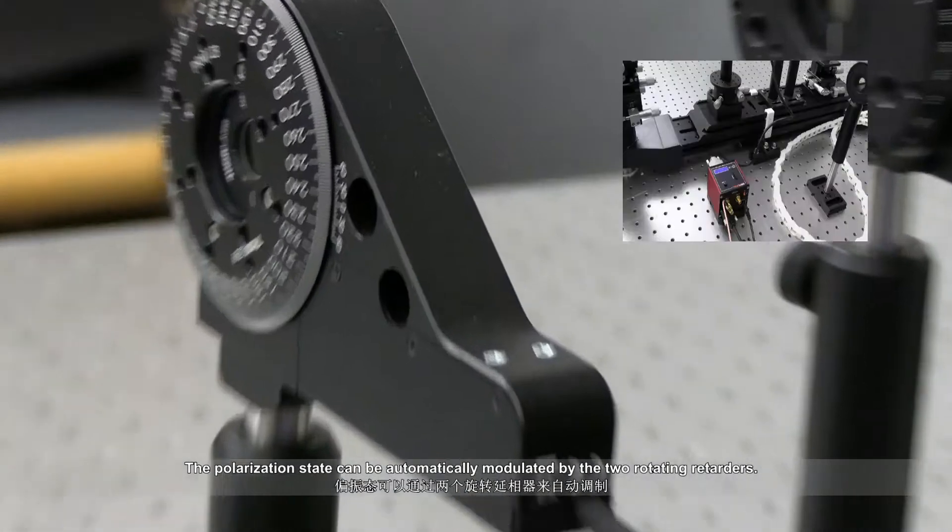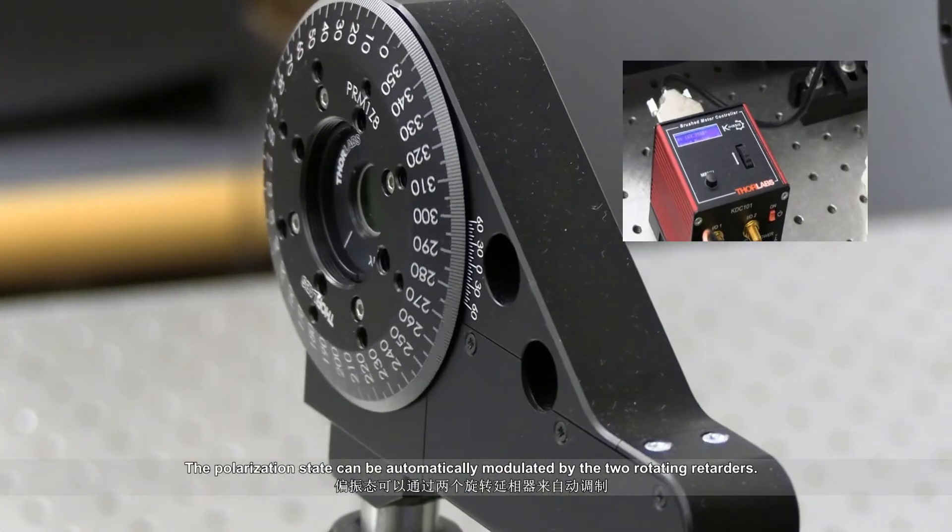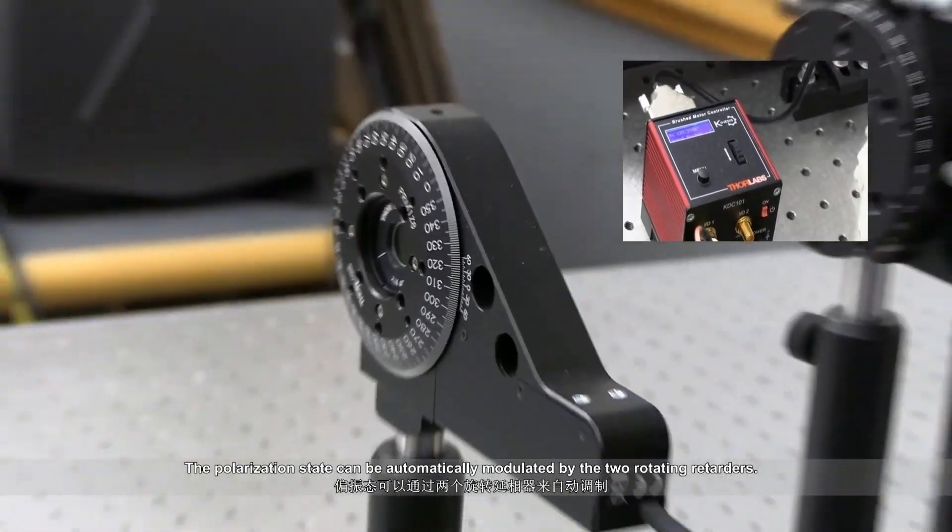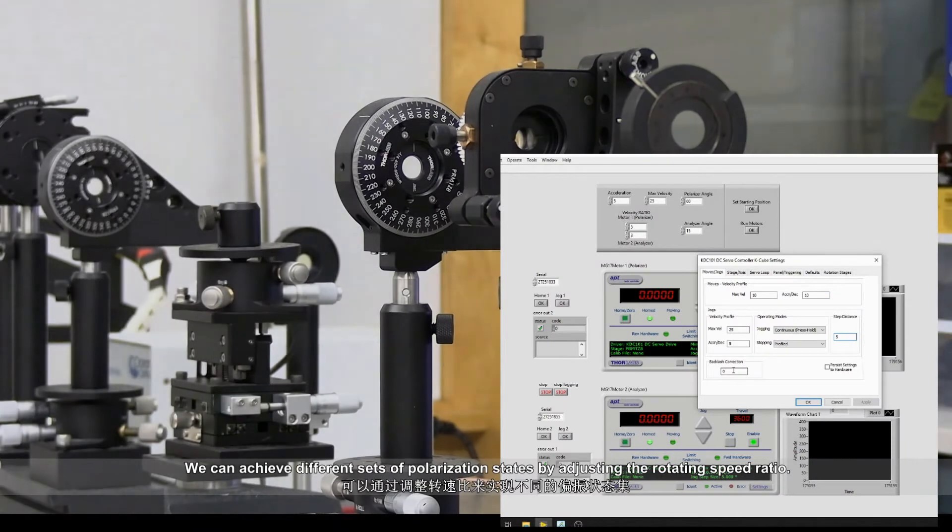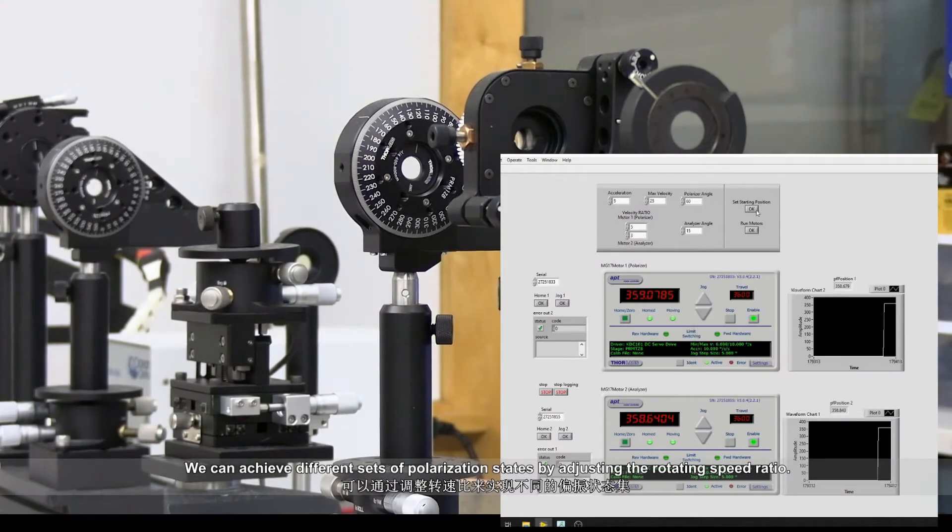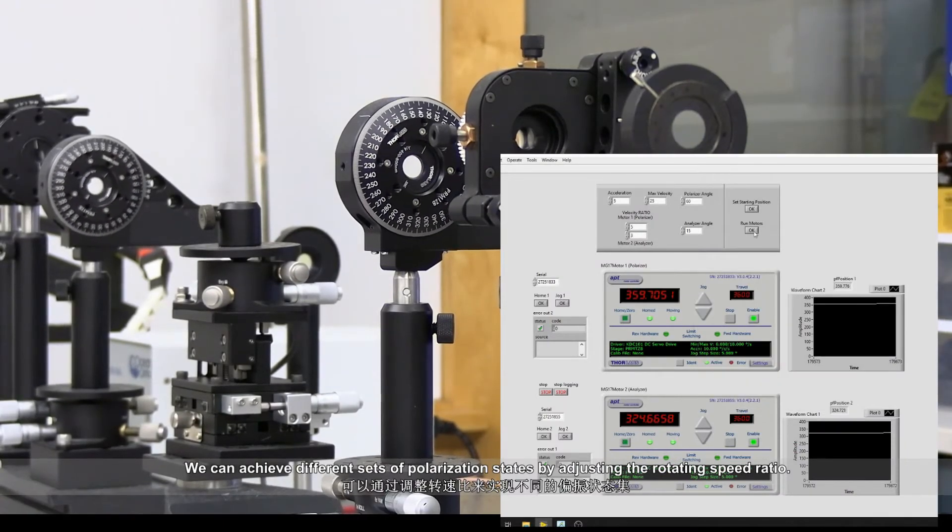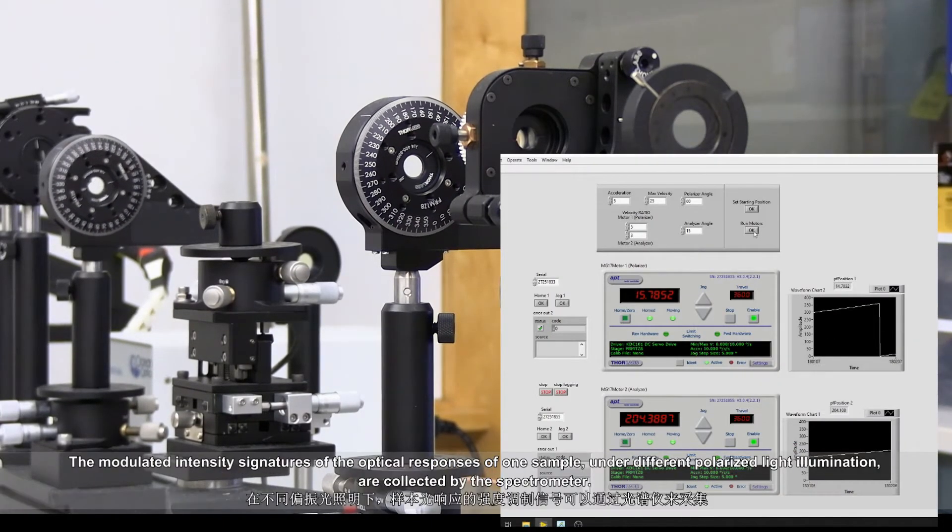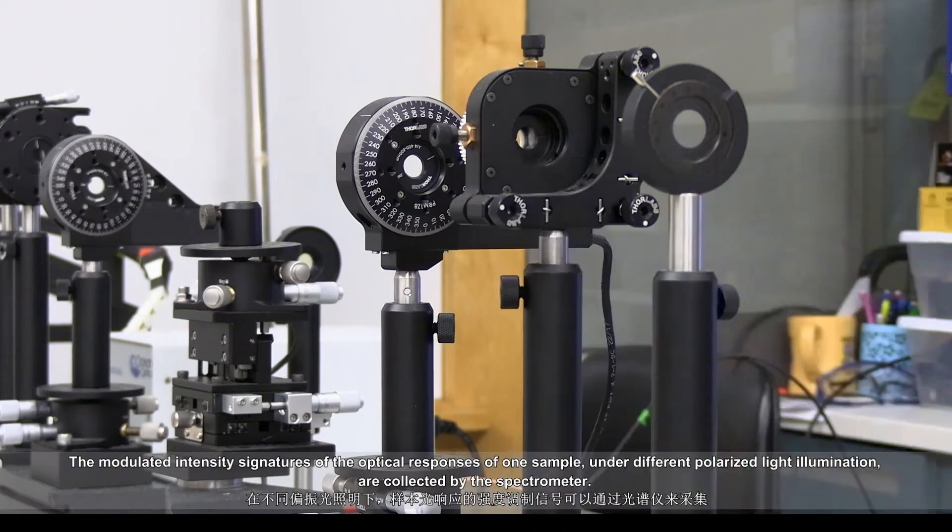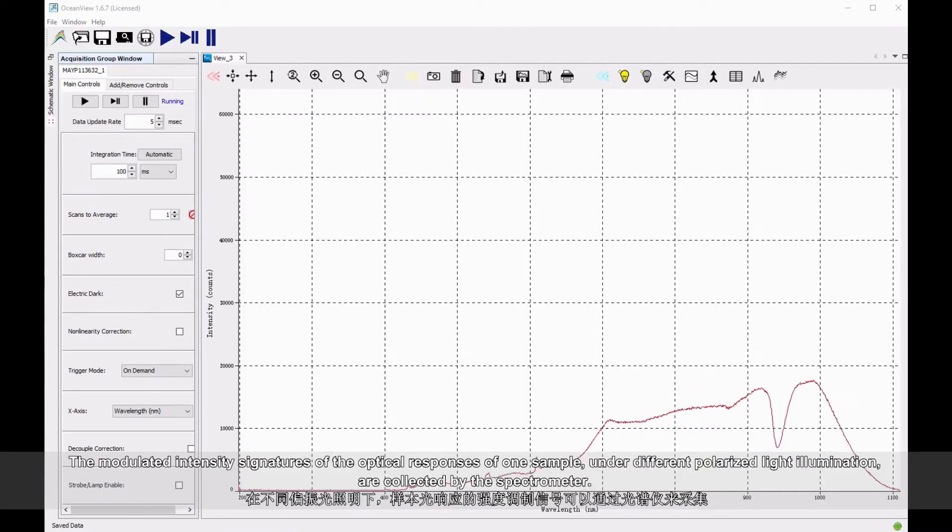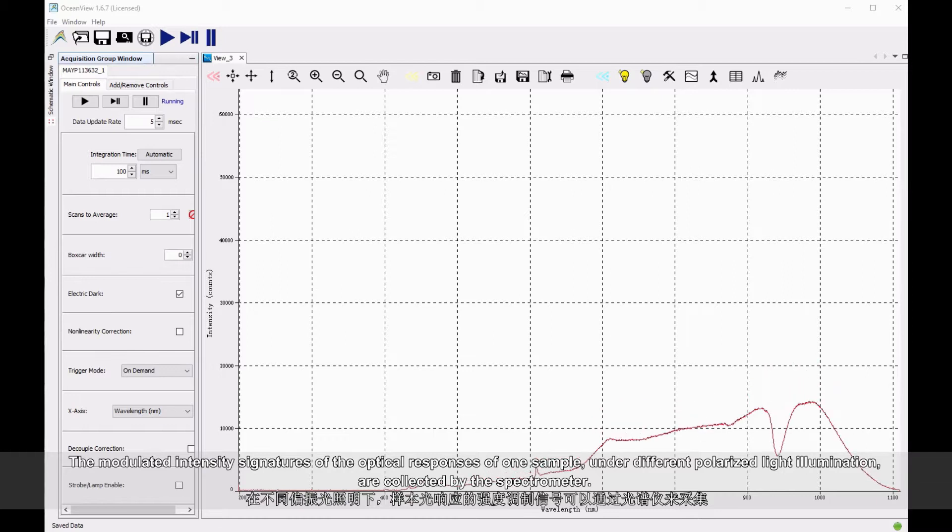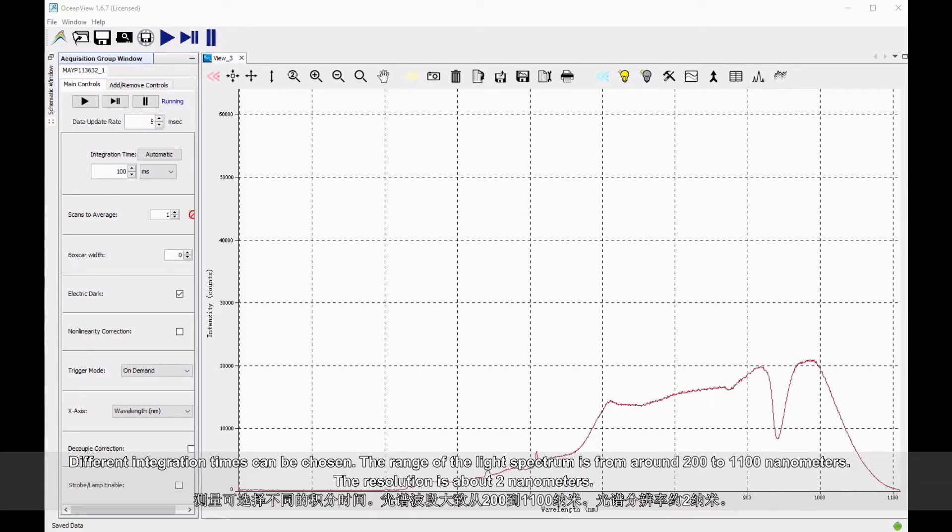The polarization state can be automatically modulated by the two rotating retarders. We can achieve different sets of polarization states by adjusting the rotating speed ratio. The modulated intensity signatures of the optical responses of one sample, under different polarized light illumination, are collected by the spectrometer.